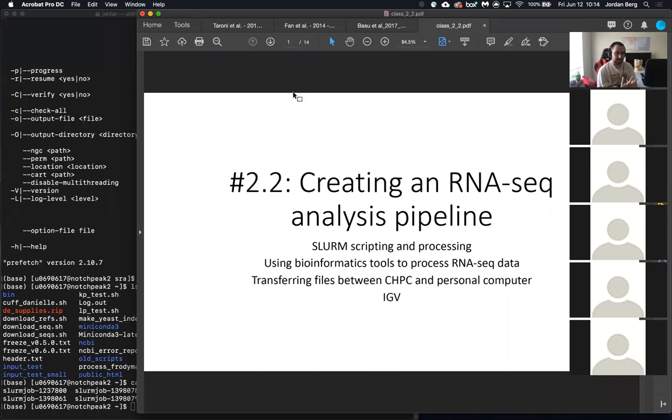So that's one reason. And also it's just nice to be able to step away and let the computer do the job where you can log out, let it run, come back to it, and work with the data afterwards. So we'll write a script today that builds that genome index. I will be sticking with yeast today, but you'll be able to adapt this to any model organism that you can find on Ensembl.